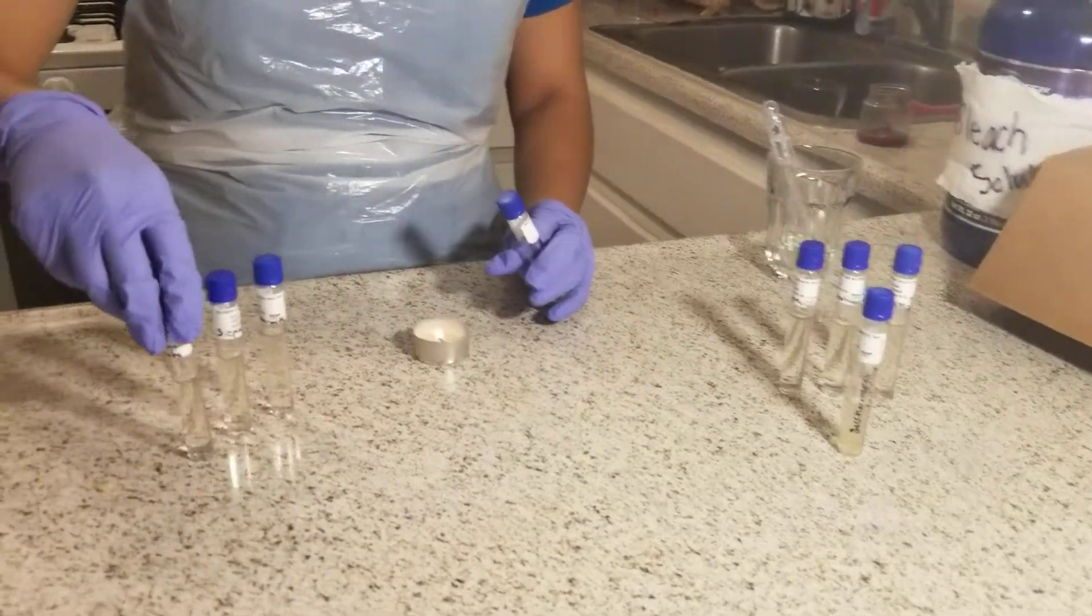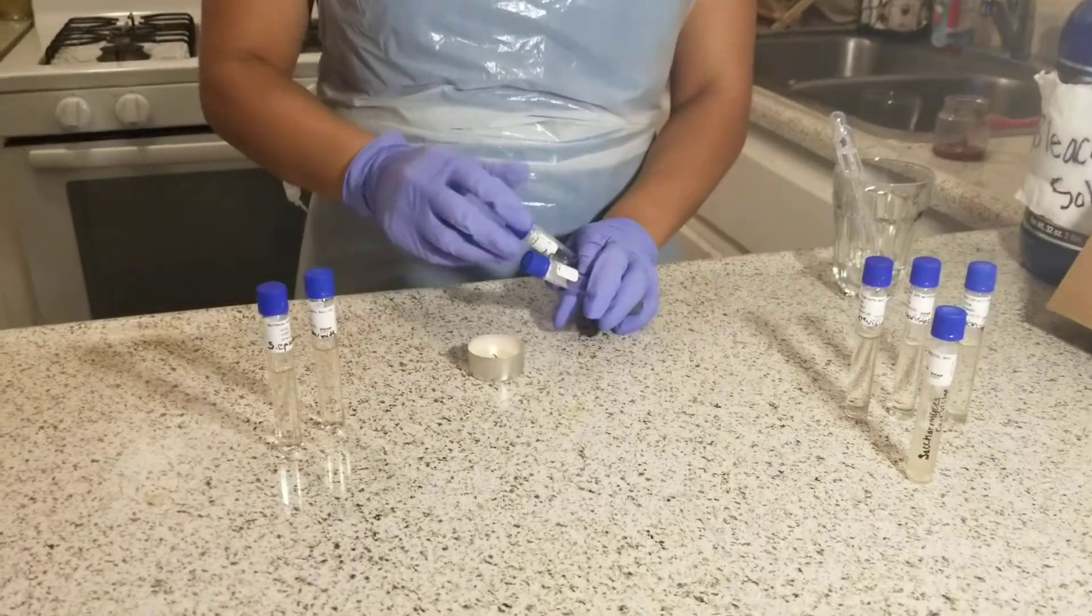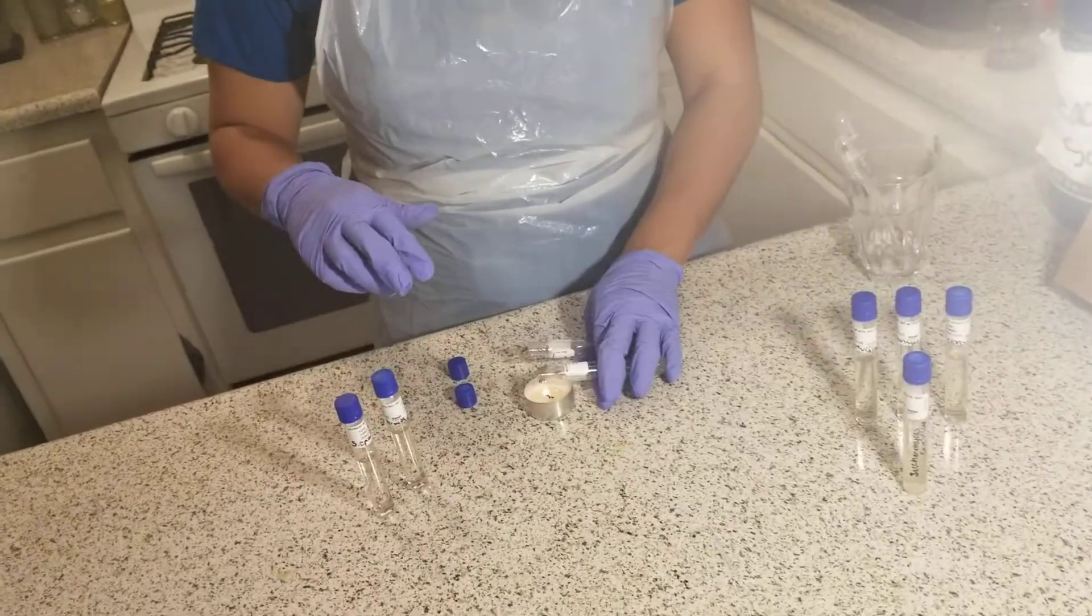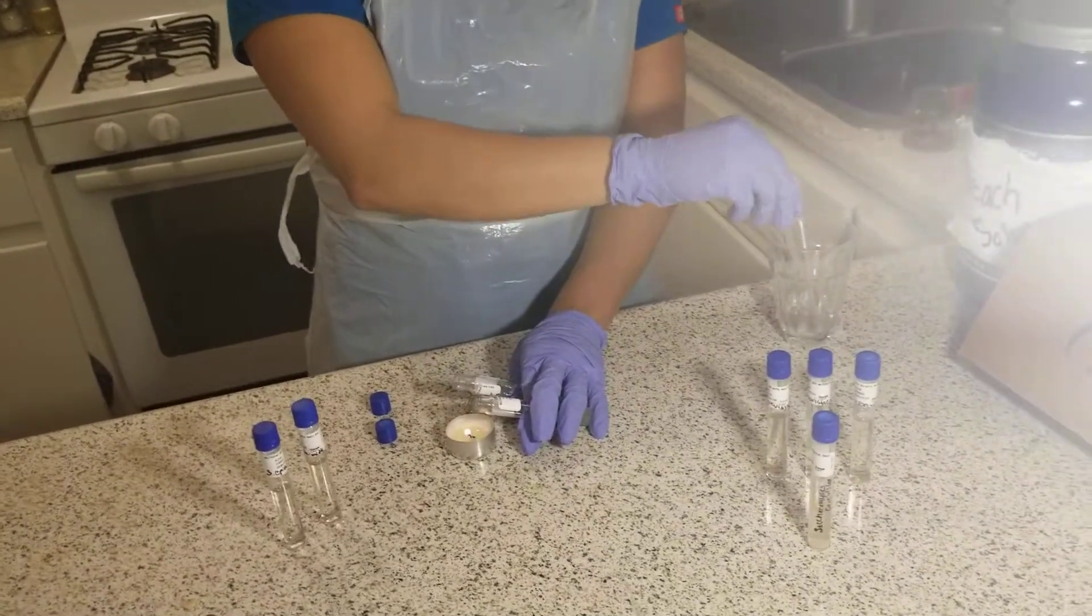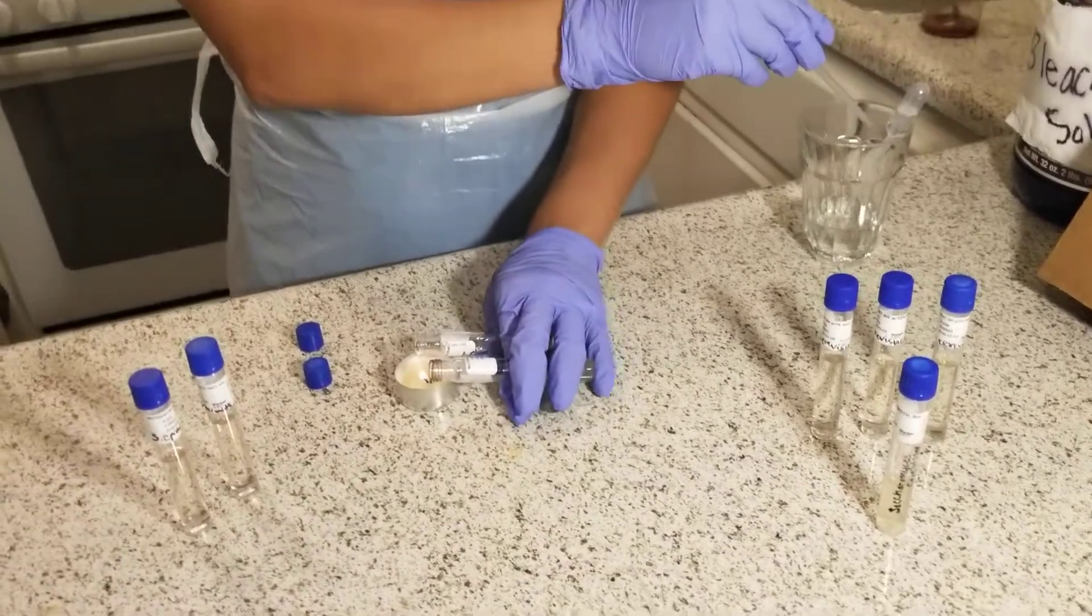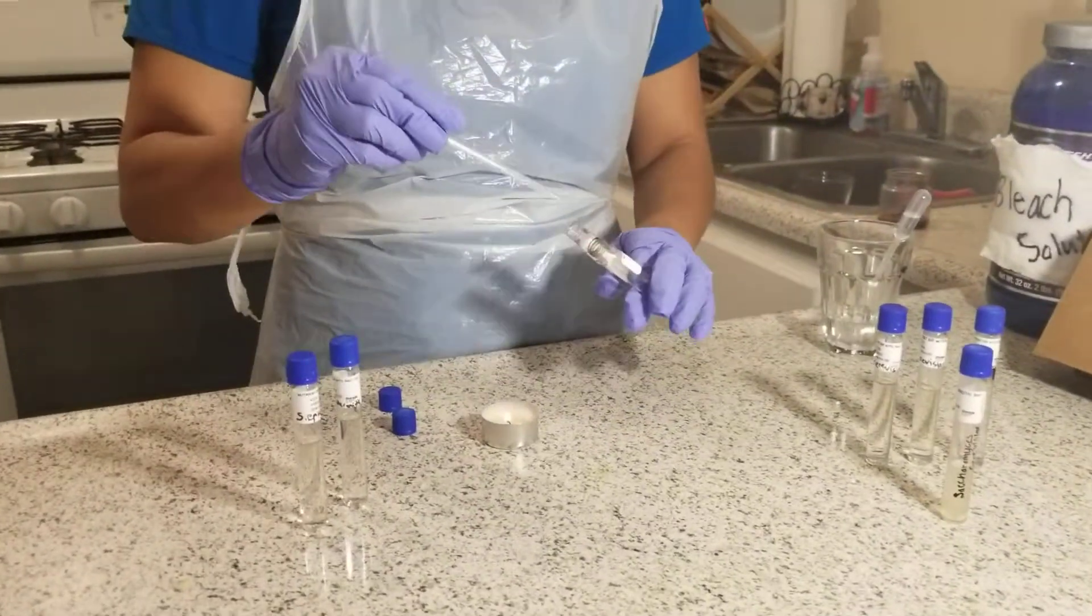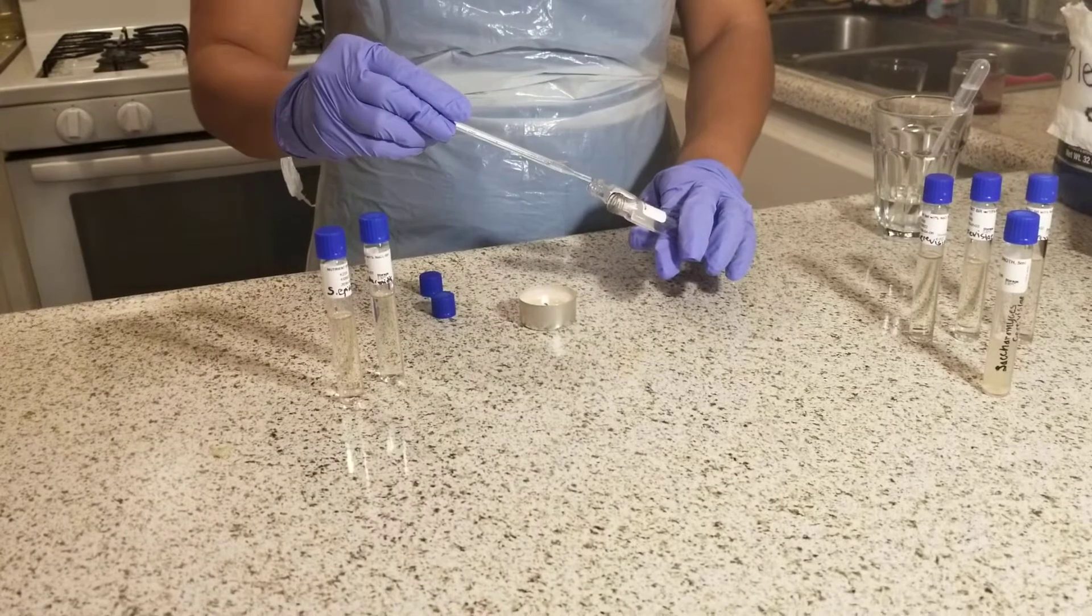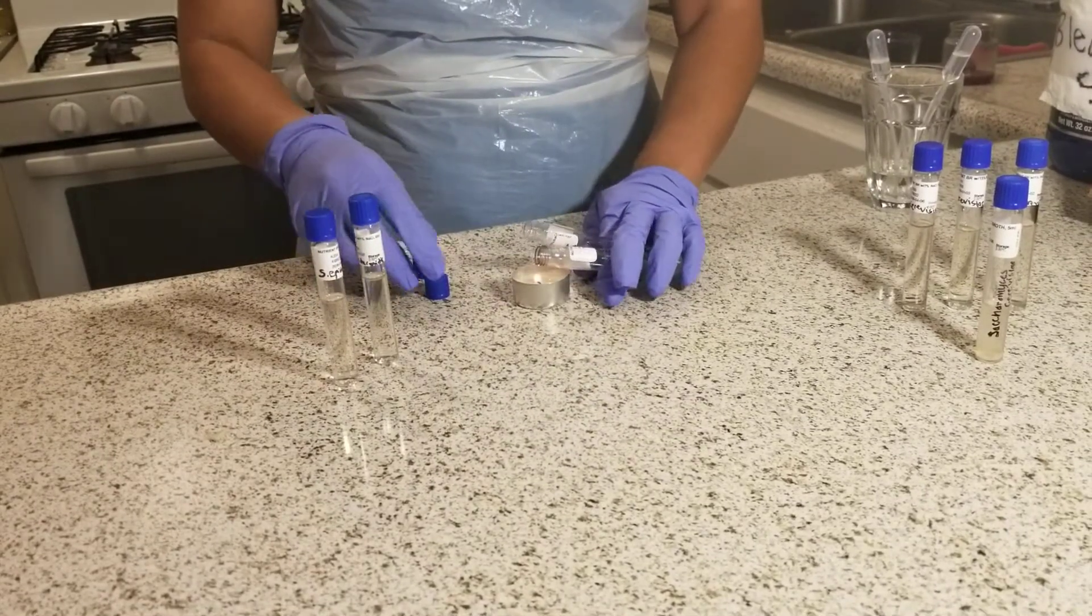Lastly, I'm going to grab the 15% sodium chloride tube. Same procedure. I'll sterilize the lid, collect 2 drops of the bacteria, and transfer them into the sodium chloride. Then I'll sterilize the lids of both tubes.